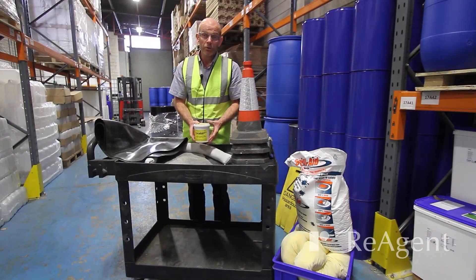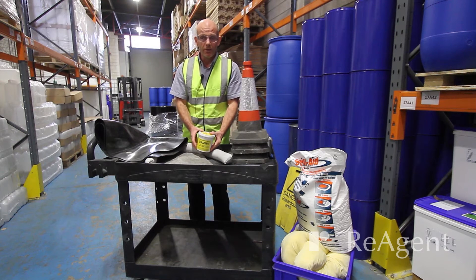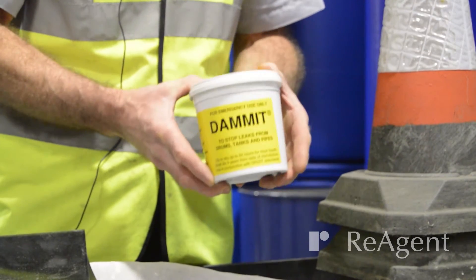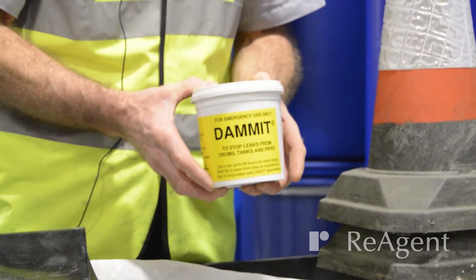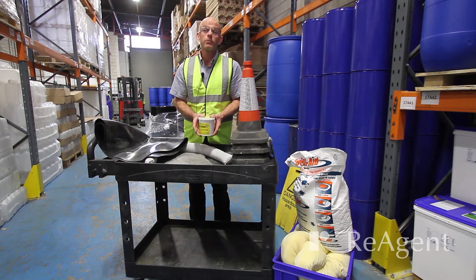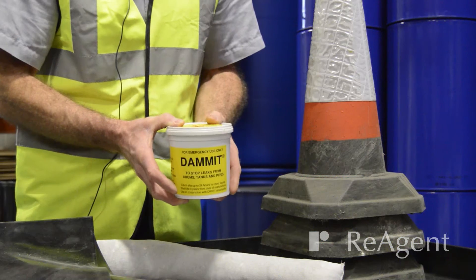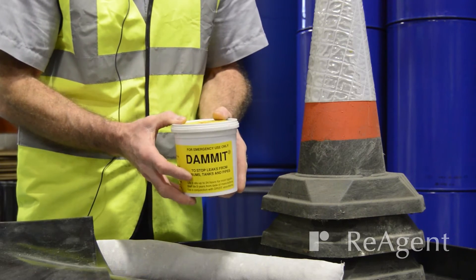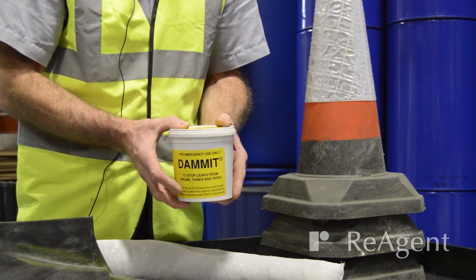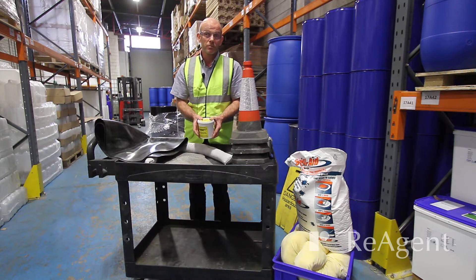In the event of a leaky drum or container, we may need to contain it as best we can. We have this putty-like material called Dam It — though other brands are available. If your container is leaking, for example if it was struck by a forklift truck, you take out the putty and slap it onto the side of the drum. It forms a seal for up to 24 hours. Operator safety is paramount, so the correct PPE must be worn when applying it to something hazardous.